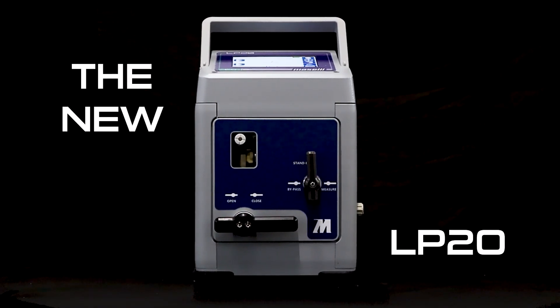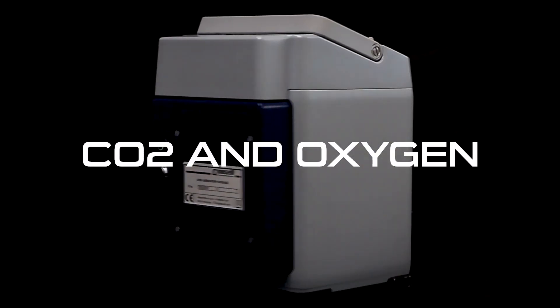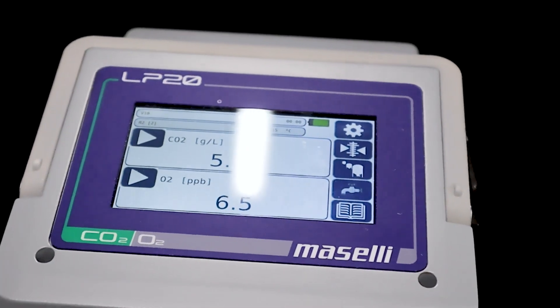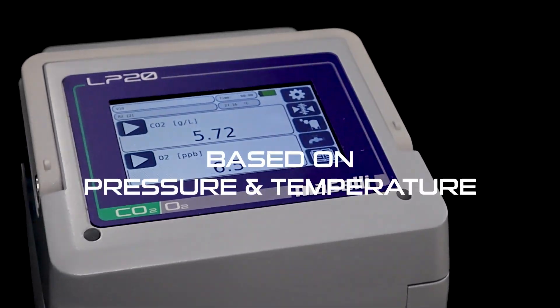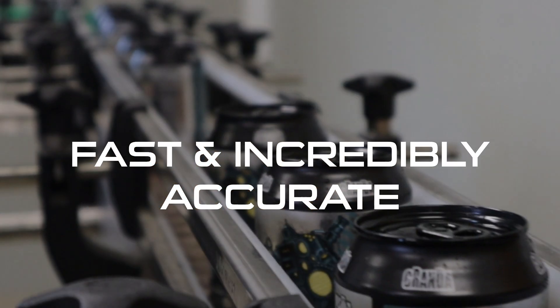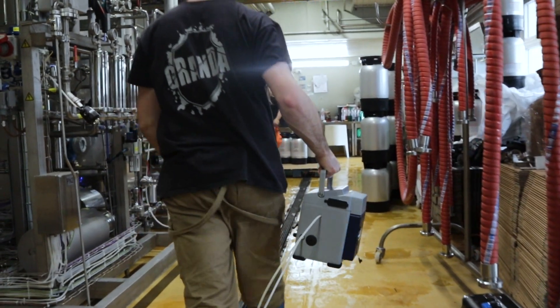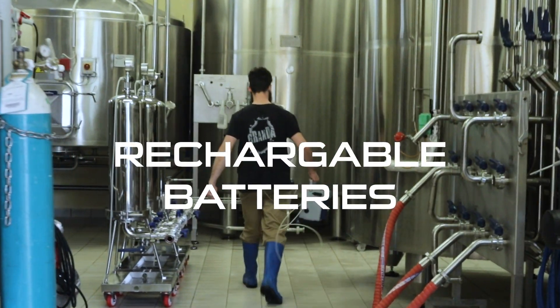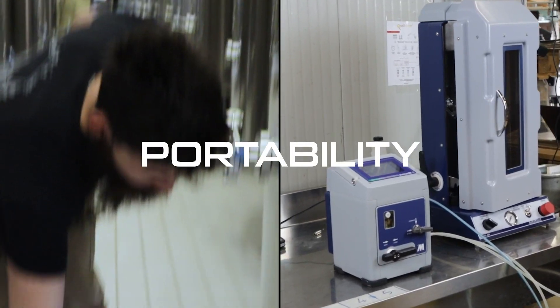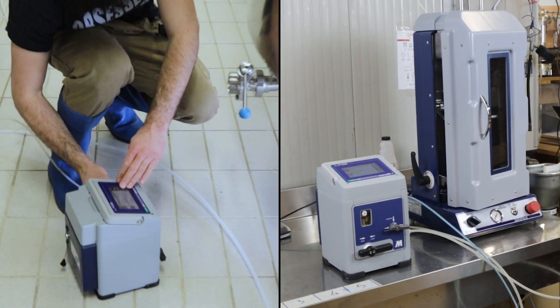The new LP20 is the ultimate tool to measure CO2 and oxygen in any beer. It combines the determination of CO2 content based on pressure and temperature with an optical O2 measurement, to ensure fast and incredibly accurate analysis. With its own rechargeable batteries, it can be taken anywhere.